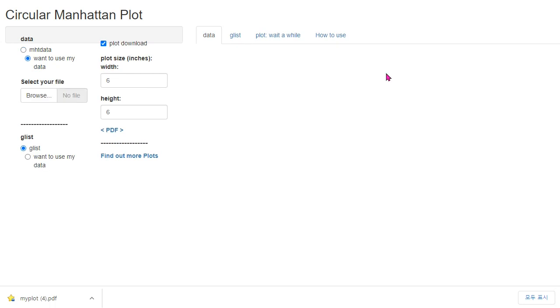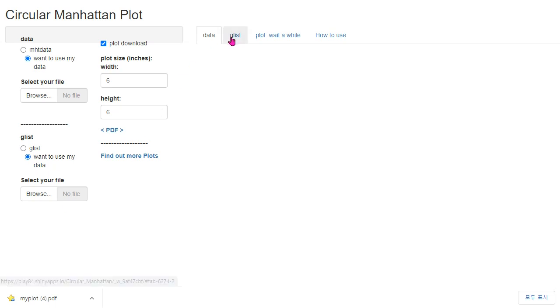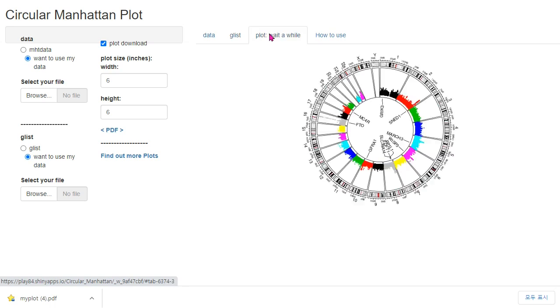Click. In Excel you can save your data as a CSV file and then upload this. And this is gene list data. The second data, and then you can get your circular Manhattan plot here.